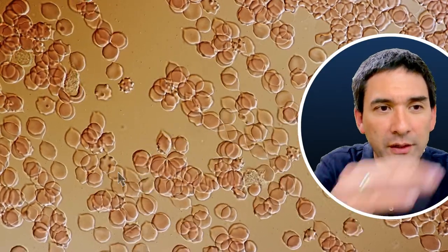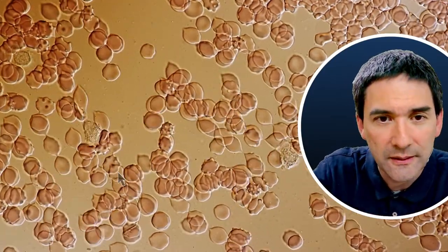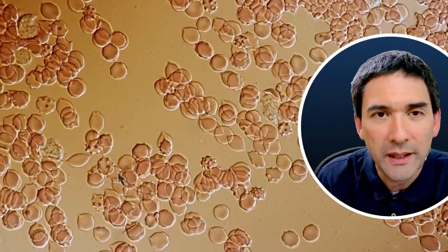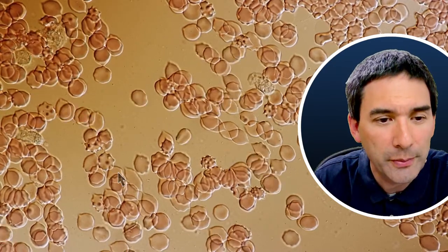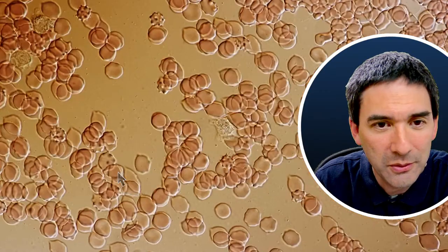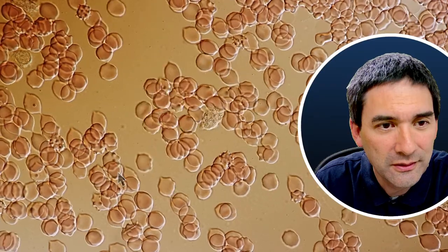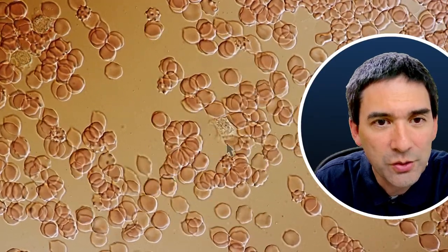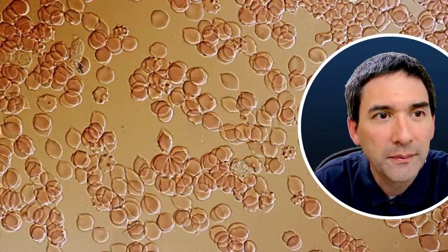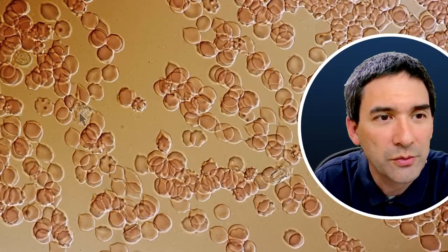So right now the blood cells are moving because the blood starts to spread beneath the cover glass. And then of course the white blood cells that are moving around, they don't care so much about that. And look, there are several of those. Let me do this again here, because there are actually several of these white blood cells. Here it is. There's one over here. There's one up here in the corner. Here as well. One over here. So this one is moving down here as well.